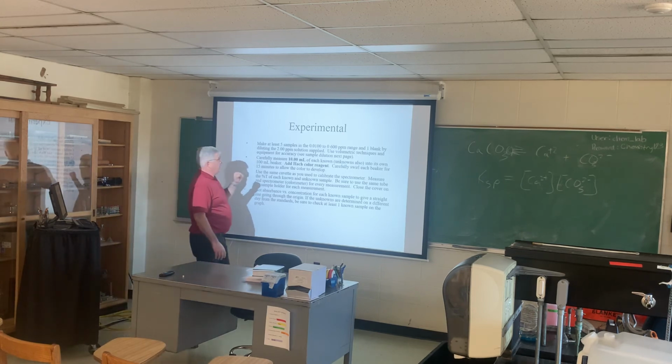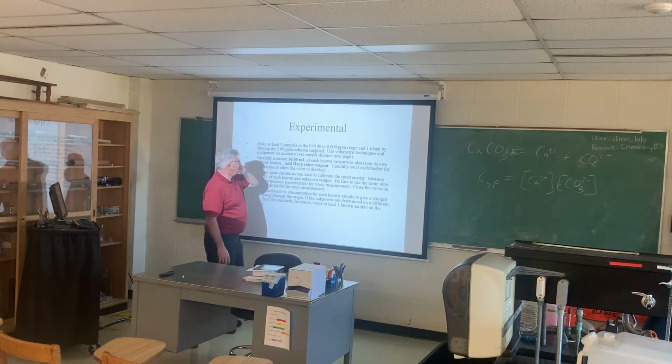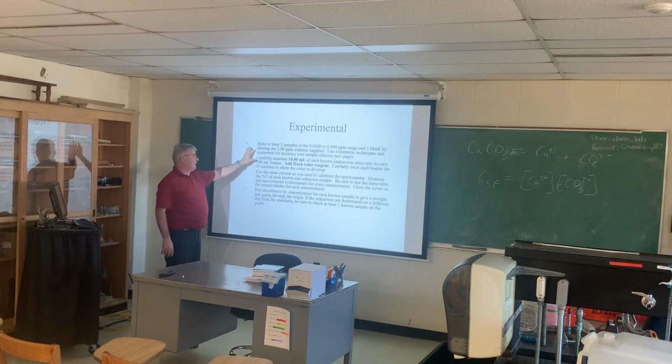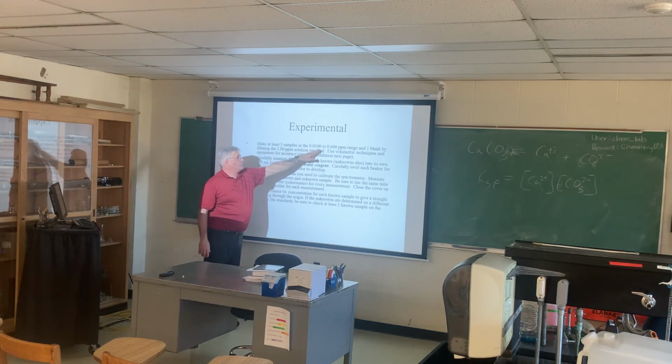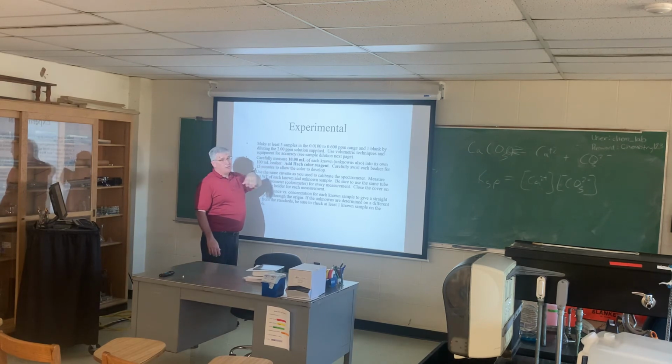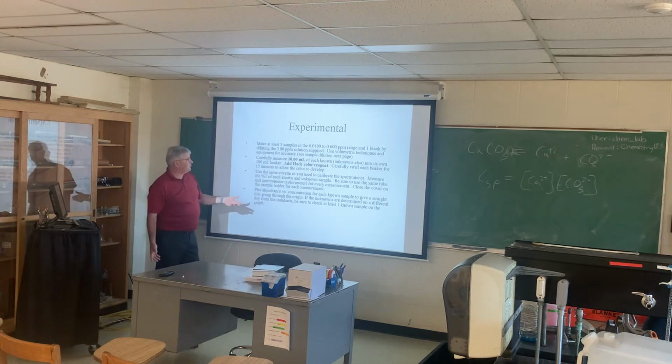If you printed your lab early, this has changed a little bit. I say to make at least 5 samples from 0.01 to 0.6 part per million range, and then you'll need a blank, and you can do the concentrations of your standards from a 2 part per million standard solution. We're going to supply that, so you'll need to do dilutions.